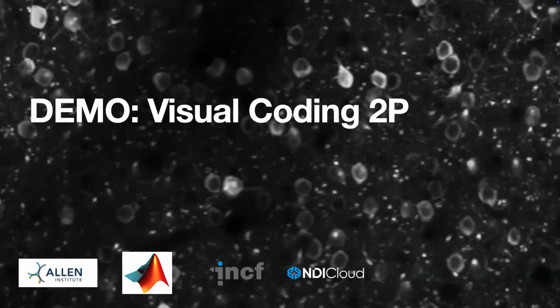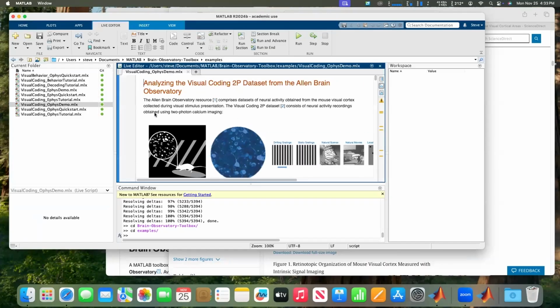And we will go through a demo exploring the visual coding two-photon dataset. We're going to use this demo for two purposes. We're going to show how to extract data from the visual coding two-photon dataset from the Allen Brain Observatory, and we're also going to use this to answer a scientific question.